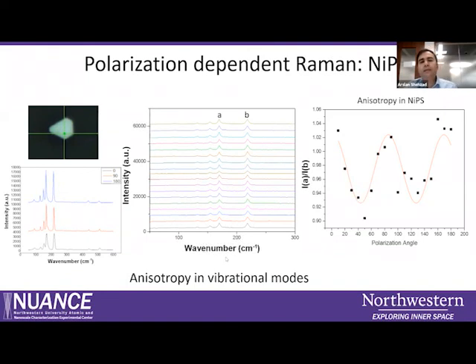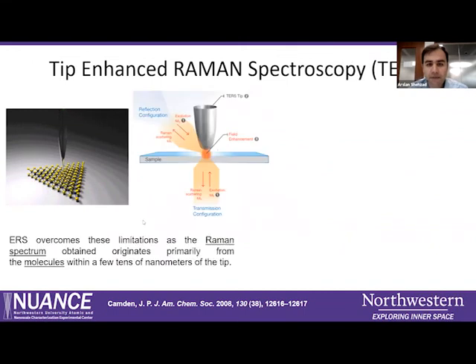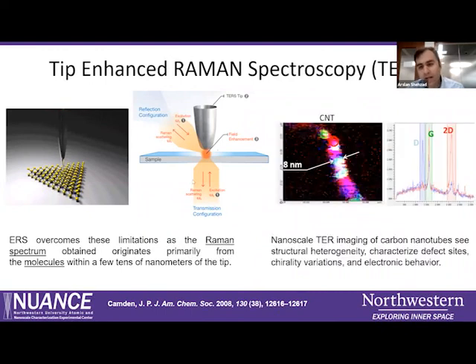With that, I would like to add a little bit about the TERS, which is going to be added to our facility. TERS is a technique where we can utilize an AFM tip to enhance the lateral resolution of the material system. Here is the working principle, and on the right side is an example which confirms this: you can see, for example, a carbon nanotube which is almost 8 nanometers in size.